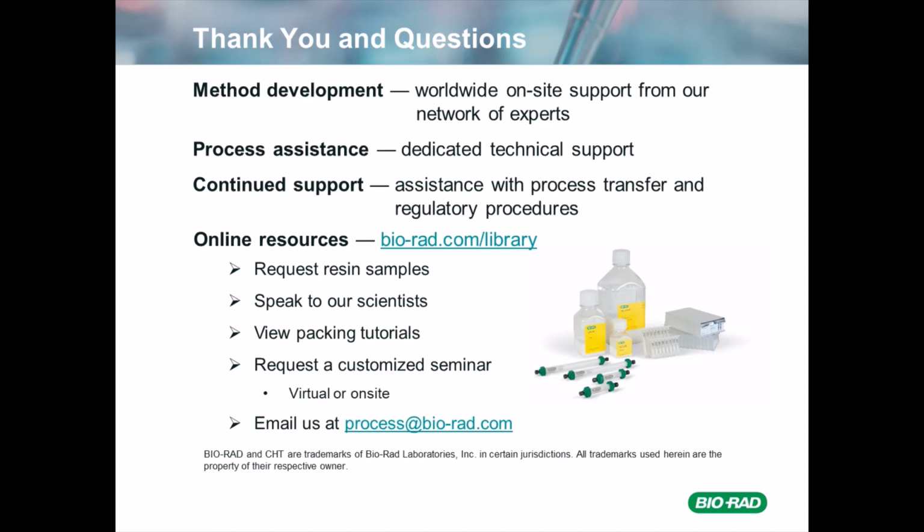Okay. How do you set HETP and asymmetry requirements with process development data? So during process development itself, typically you don't. At small scale, you pack a column, you pretty much get what you get, and you just make a note of that so that you know what ranges you've used as you scale up. If you are doing step elution, frankly, neither of these really matter very much. You need one plate per meter, as I think I alluded to in the talk. And asymmetry is more a function of how big an elution volume you actually want to get.